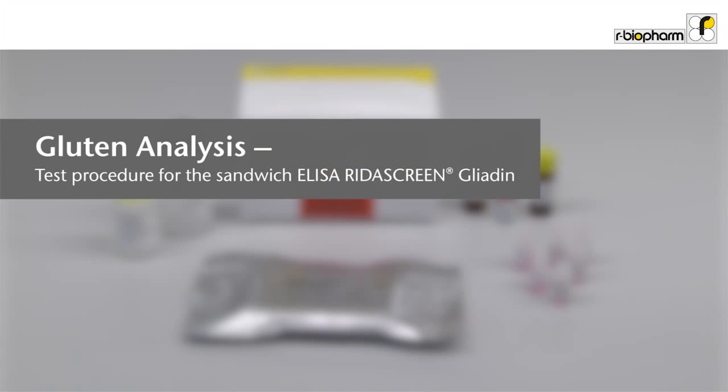Gluten Analysis Test procedure for the sandwich ELISA RIDASCREEN Gliadin. RIDASCREEN Gliadin in combination with the cocktail extraction patent is the most used method for gluten analysis worldwide. It has been validated in two international collaborative studies and is now an official AOAC-OMA and AACCI method.